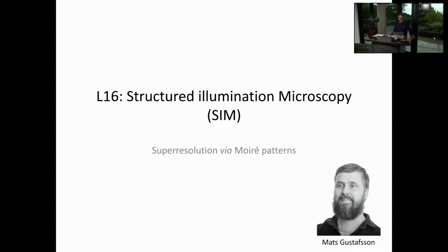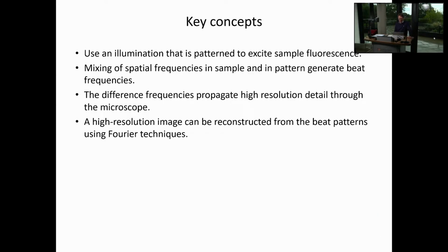But he published a seminal paper on structured illumination microscopy. And so the idea is that you generate what is called moire patterns, super resolution via these beat patterns or moire patterns. So let's go and take a look at this technique.